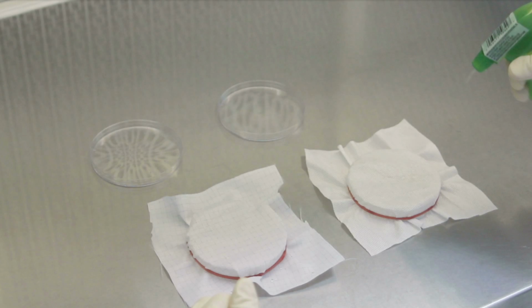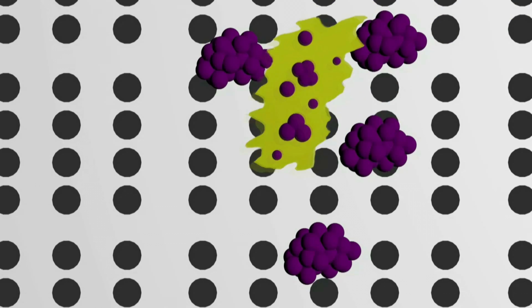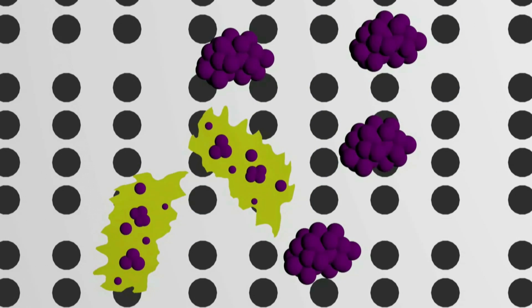The second problem with this test is that it uses a pure culture of Staphylococcus bacteria suspended in a liquid to challenge the fabric. Some individual bacteria can enter the pores and pass through the fabric. However, most of the bacteria will occur in clusters, which are too large to pass through the fabric, artificially increasing the BFE. Also, in the real world, these bacteria get from one place to another by hitchhiking a ride on larger particles such as skin flakes. These skin flakes are not able to pass through the fabric.